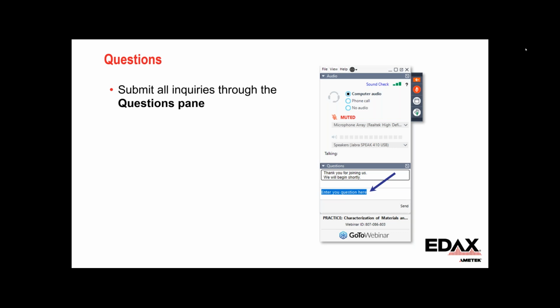And then there's another question here. With NPAR reindexing, do you expect the grain boundary texture to change significantly? To explain, NPAR averages neighboring patterns. So I don't expect the grain boundary texture to change significantly because it's going to be averaging essentially one side of a grain or the other. So those two orientations, I think, will still converge at the boundary. Essentially that may change the size slightly.